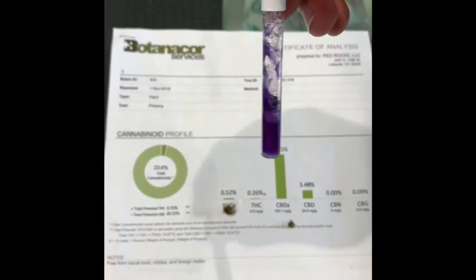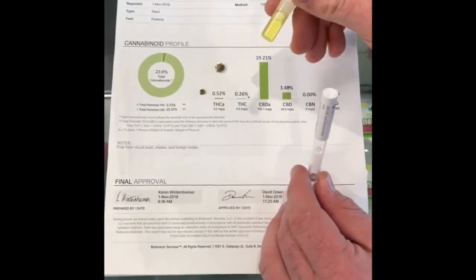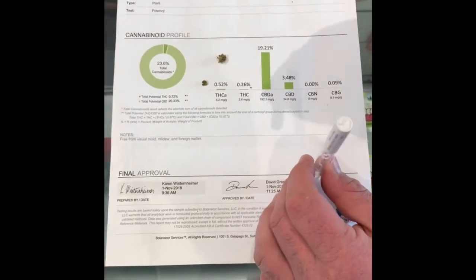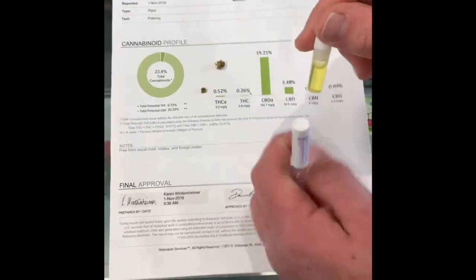So I guess, is that a positive test? That's a presumptive positive. Okay. All right, next step up is we're gonna test a CBD extract. An isolated extract, an isolate extract. So there should be no THC in this at all, it should just be pure CBD.